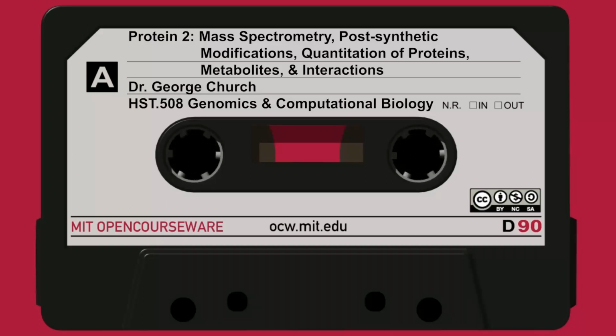The N and the S at the highest molecular weight are not visible. And actually, many of these things, you'll have very weak peaks, essentially missing peaks that correspond to one of the delta amino acids. So in that case, the distance between the two prominent peaks will be 2 amino acids. So you can see this is starting to get to be a challenging pattern recognition problem, because you've got all the B ions mixed in with the Y ions, and this is summarized in the next slide.